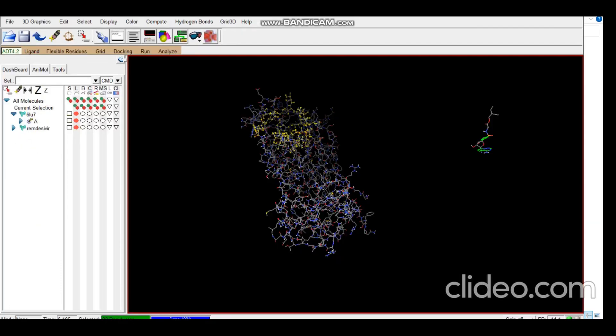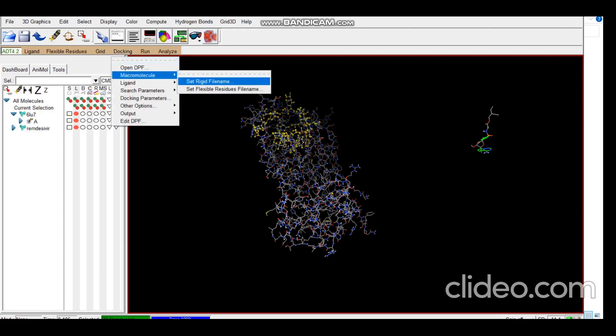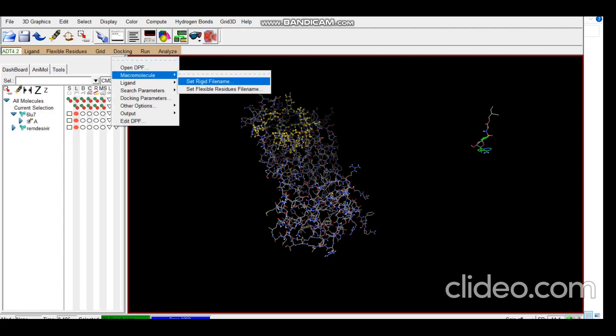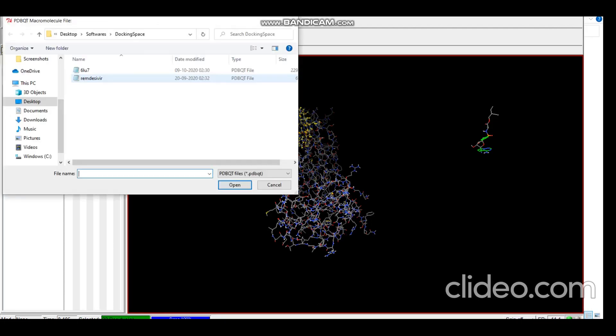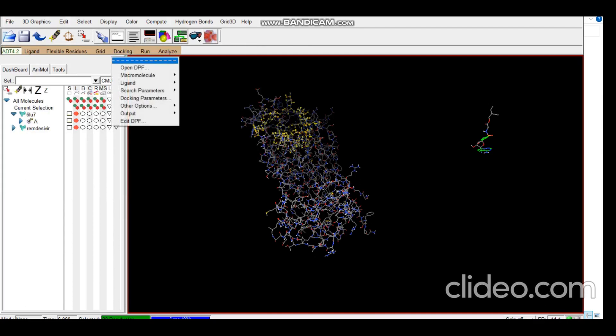So now to proceed with AutoDock, we go to Docking, Macromolecule, Set Rigid Filename, and select the PDBQT receptor. After that we select the ligand.